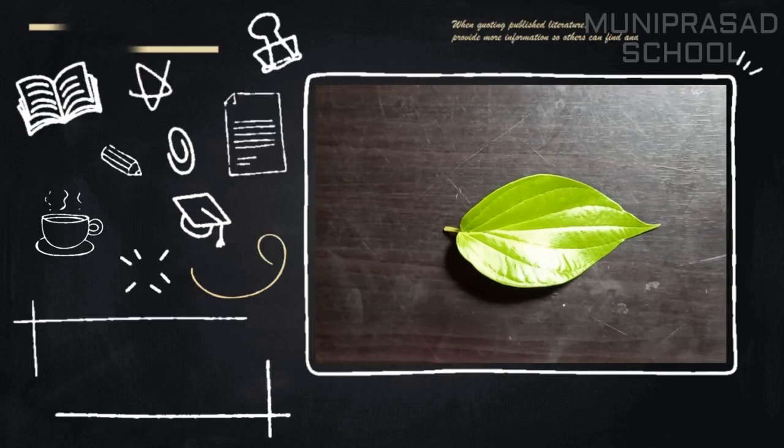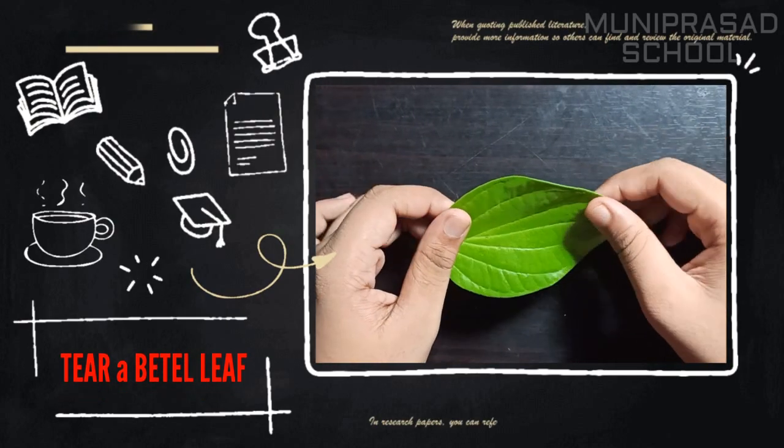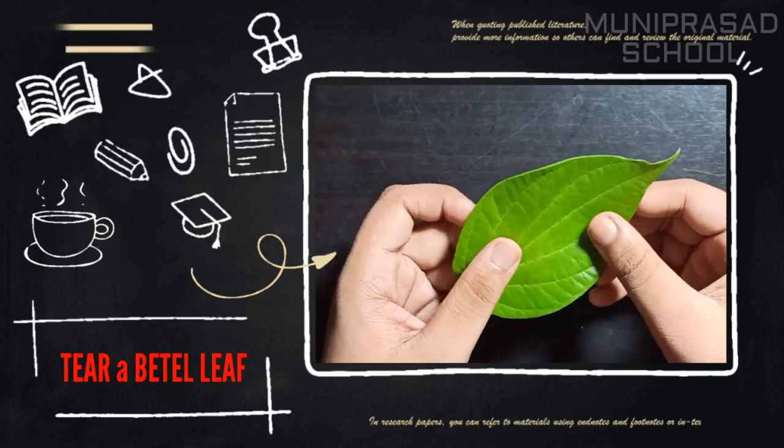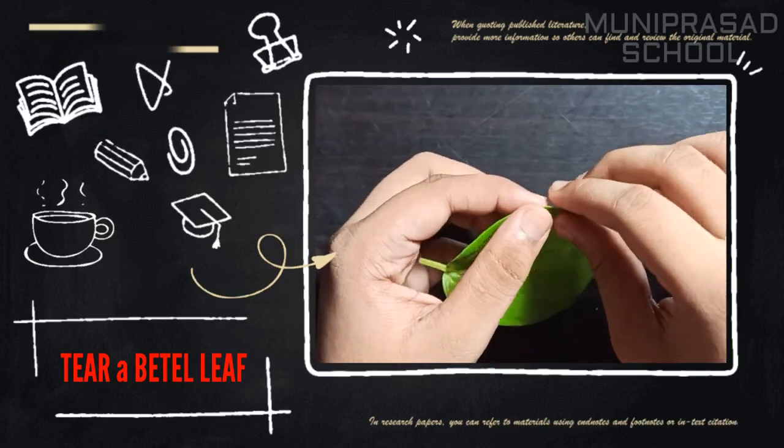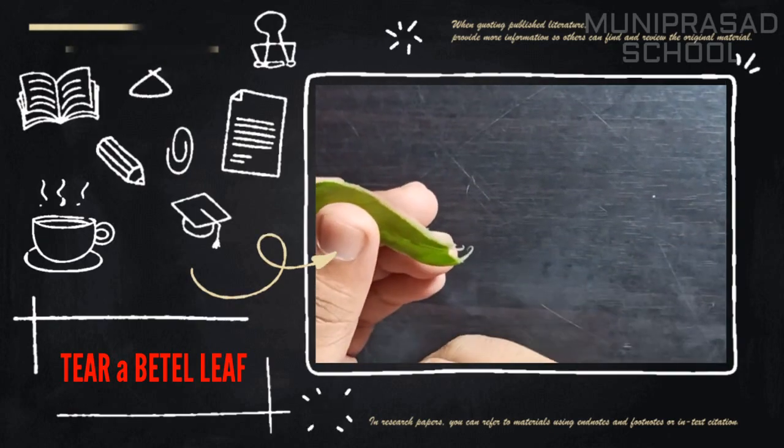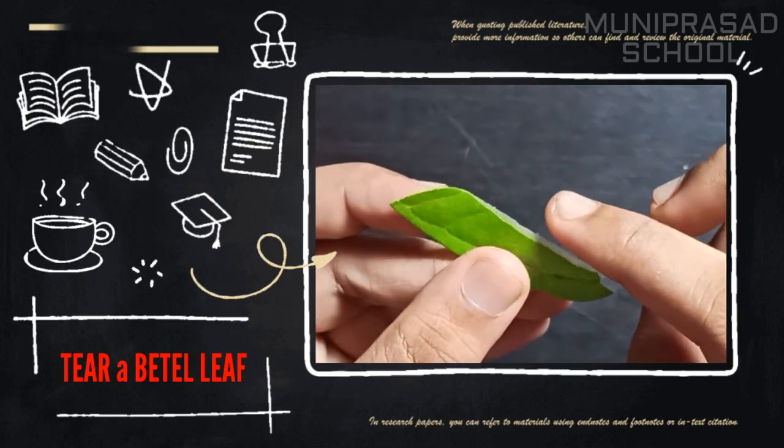Take a fresh leaf of betel plant. Tear it with a single stroke. You can see a whitish thin edge at the torn end.